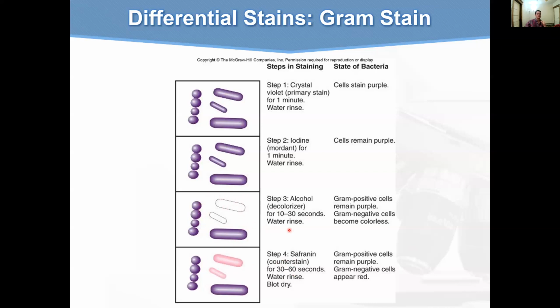So when you rinse these organisms, the Gram-negative ones will lose their coloration because they can't maintain the crystal violet in their cell structure. Thus, when you add the safranin counterstain, they will turn pink. And then you can distinguish between them: these 2 are obviously Gram-positive and these 2 are Gram-negative.